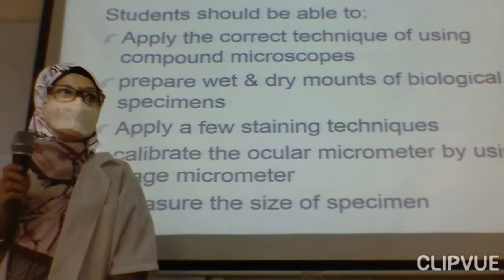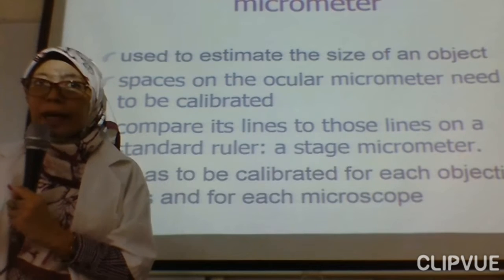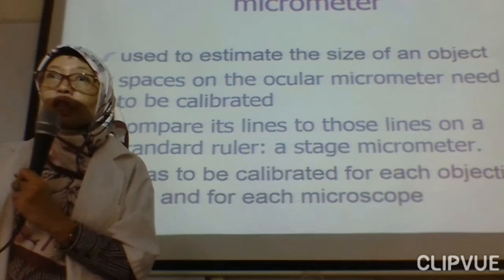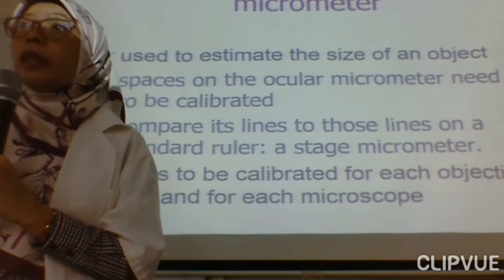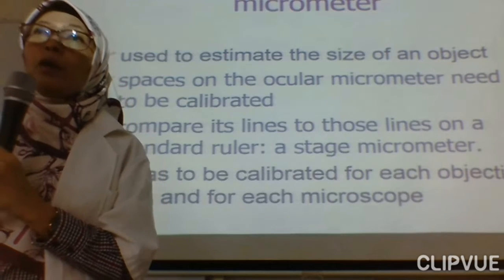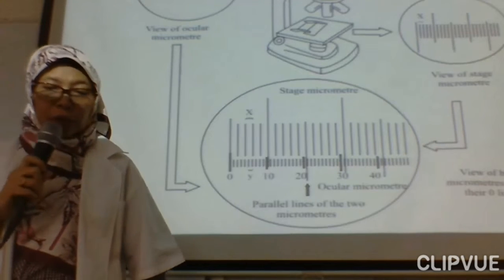So you can actually put a few of these in your learning objectives, your scientific learning objectives. You can jot down a few things: for each of the microscope objective lenses, like 4 times, 10 times, 40 times, all need to be calibrated. Normally it has been calibrated, but here I'm going to show you how to calibrate. So this is the one, so we're going to see that.